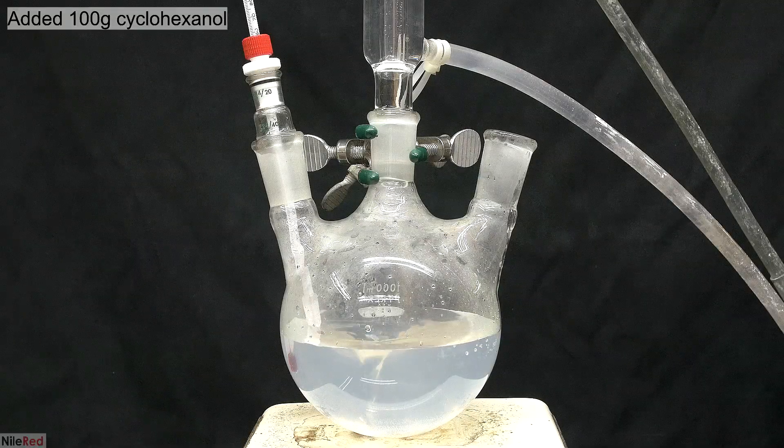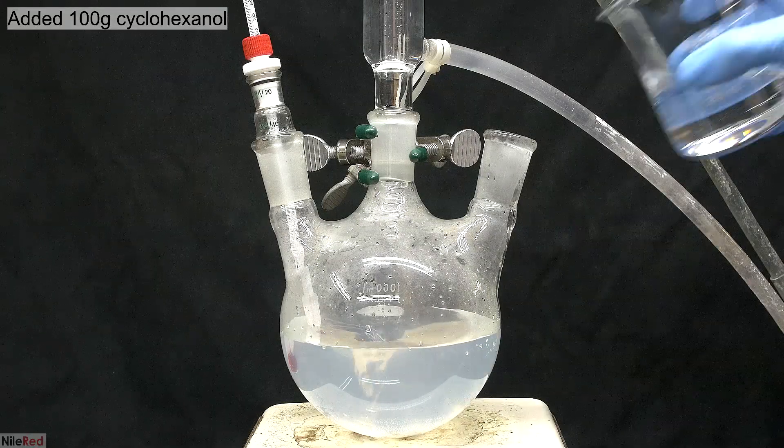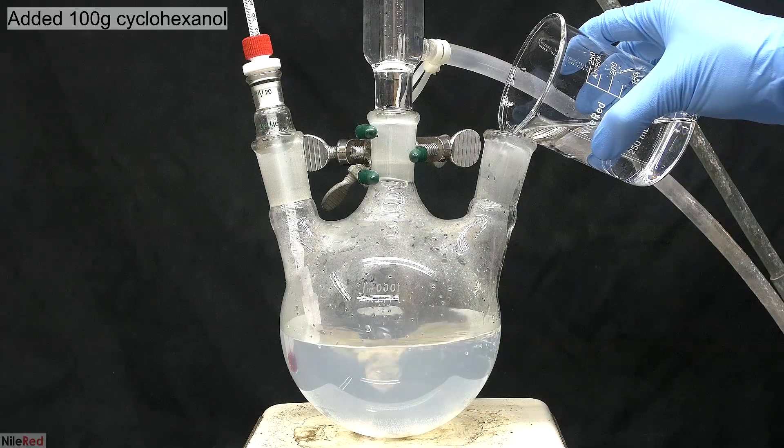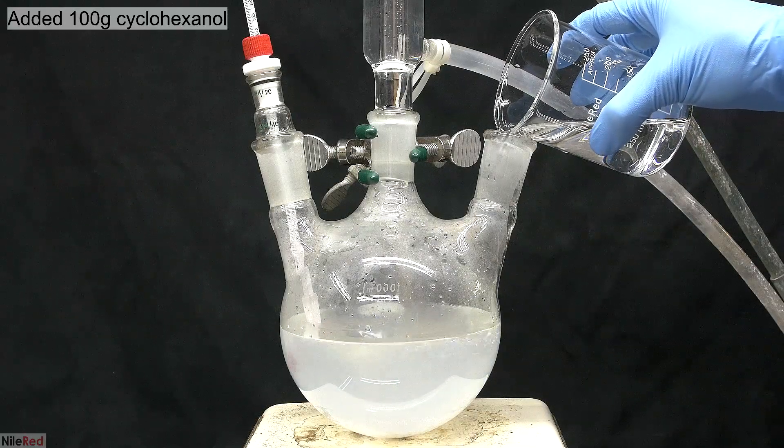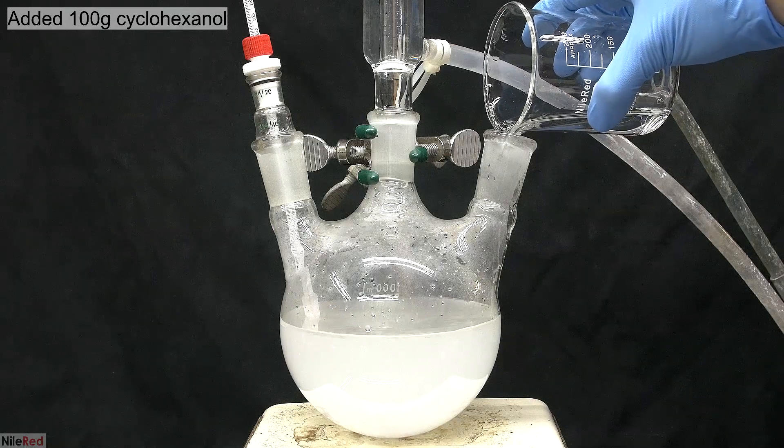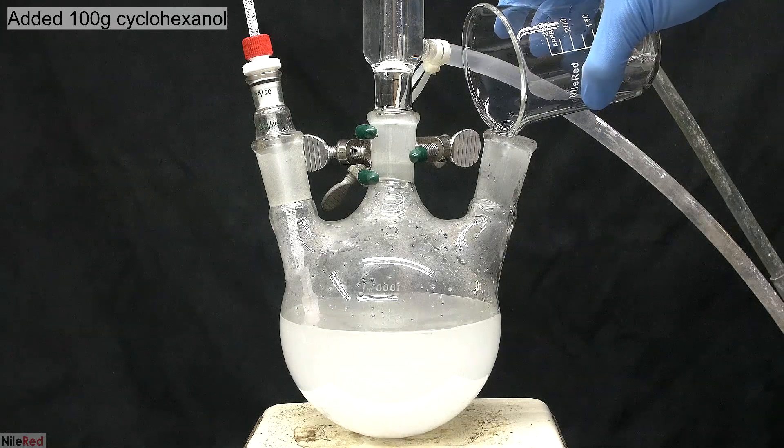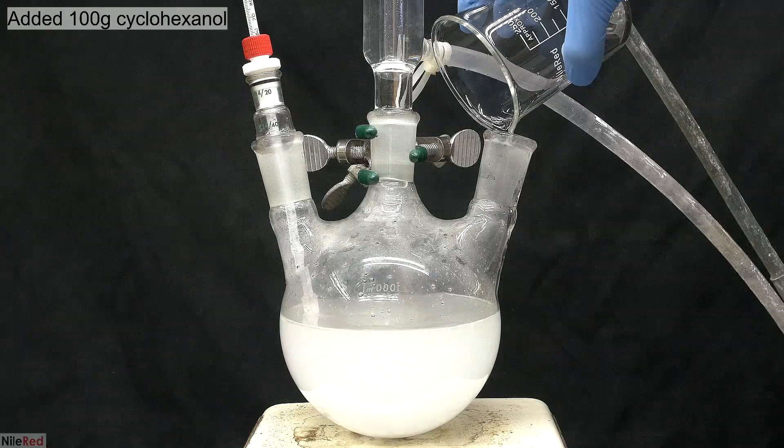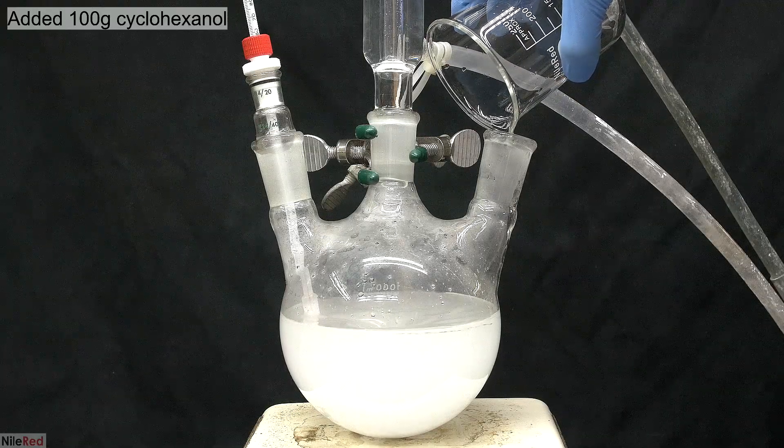With the catalyst, and all of the hydrogen peroxide loaded in the flask, it's time to add the cyclohexanol. With strong stirring, I pour in about 100 grams, and the solution quickly becomes white. Cyclohexanol is not very soluble in water, so with the stirring, we get a very fine and opaque dispersion.